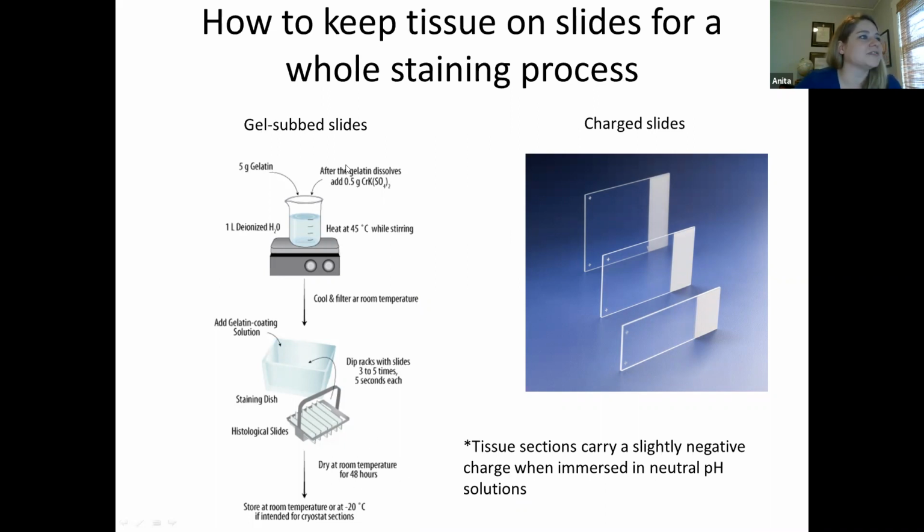You see this? This is after you spend all day making gel, which by the way is not great to work with. It can polymerize in your brain, so you definitely need to be careful working with gelatin. Then you have to use a bunch of it, coat your slides, and then you have to let them dry and then put them back. It's a pain in the butt. Buy charged slides, and don't forget that you have to have the charged slides, otherwise your tissue is going to fall off. In the case of gel, it's basically a substrate that sticks to your tissue in a thin section.